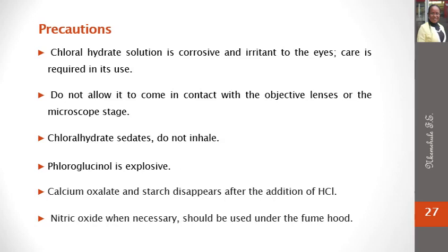Phloroglucinol is explosive. Be careful with the naked flame. Calcium oxalate crystals and starch disappear after addition of HCl. So, before you add HCl, you have to examine the sample for the calcium oxalate crystal and starch granules. Likewise, nitric oxide must be used under the fume hood.